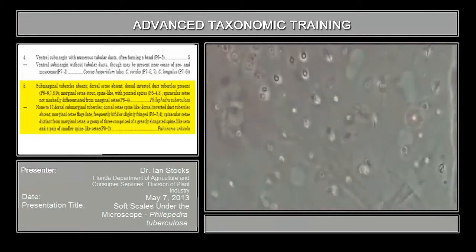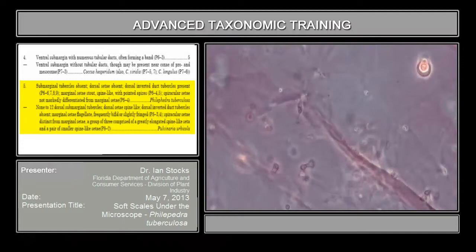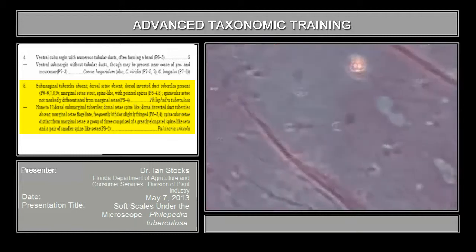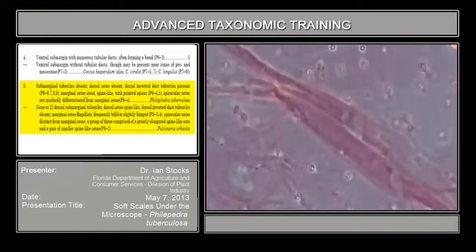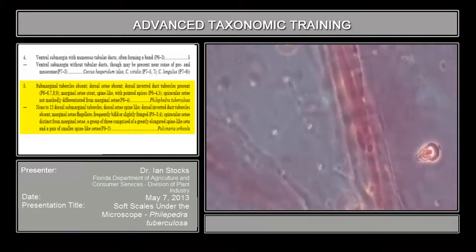And I'm having a hard time finding one that really works here. But you can just about perceive in plate 6, figure 9 at the bottom that it does have a fairly complex morphology there. It's a fairly strongly three-dimensional structure, so it's hard to get a good picture of all of the components at one time.